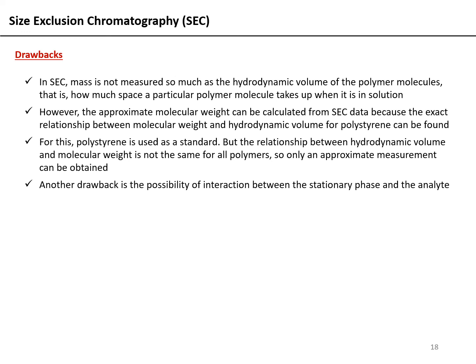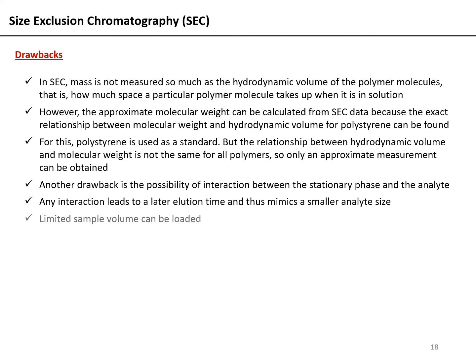Any interaction will lead to a later elution time, and this mimics a smaller analyte size. Because of this interaction, your protein would be eluting out later, and you would think that it probably has a smaller size. So it might lead to misleading conclusions, but it might not always be the case.